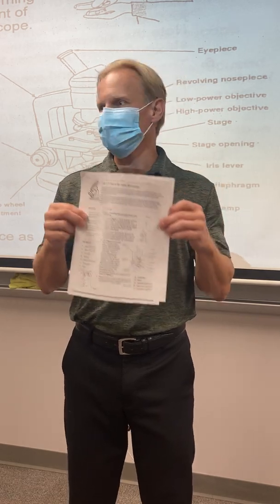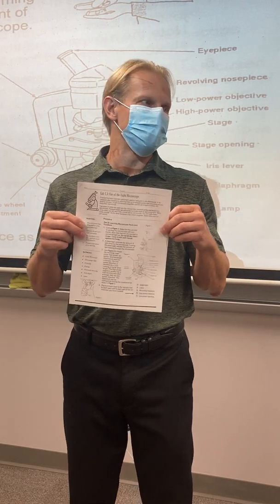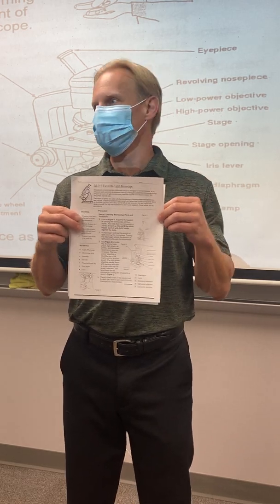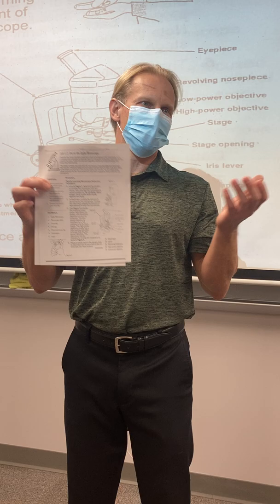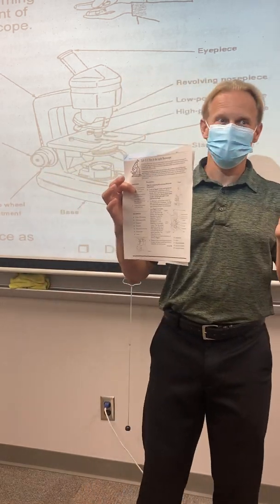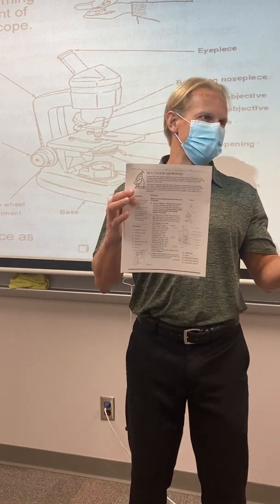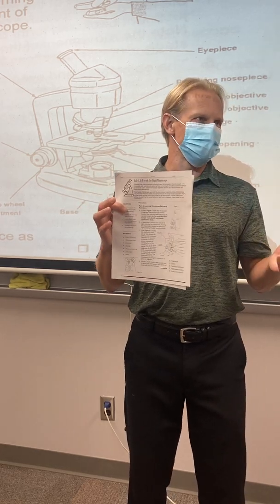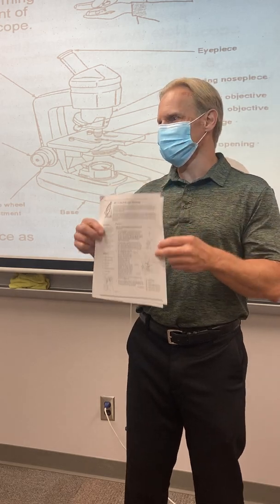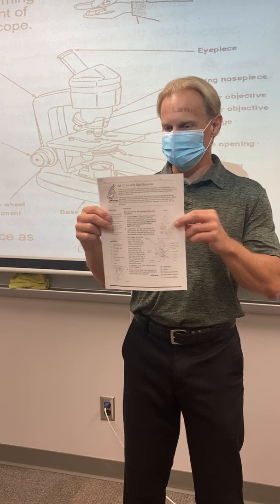If you depend entirely on your partner for all of this, when your partner doesn't happen to be here, you're going to be in trouble because you're going to be standing there waiting for me to help you while everybody else has already figured their stuff out and is working on the lab. So step one is just get it in focus so we can see what we're looking for, and then we do the lab. Today is all about practice, basically learning this skill really well, as best as we can in a one class segment, okay?